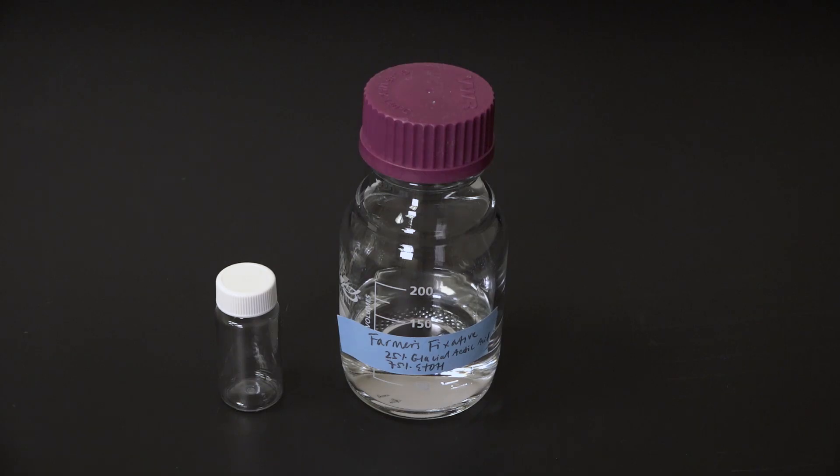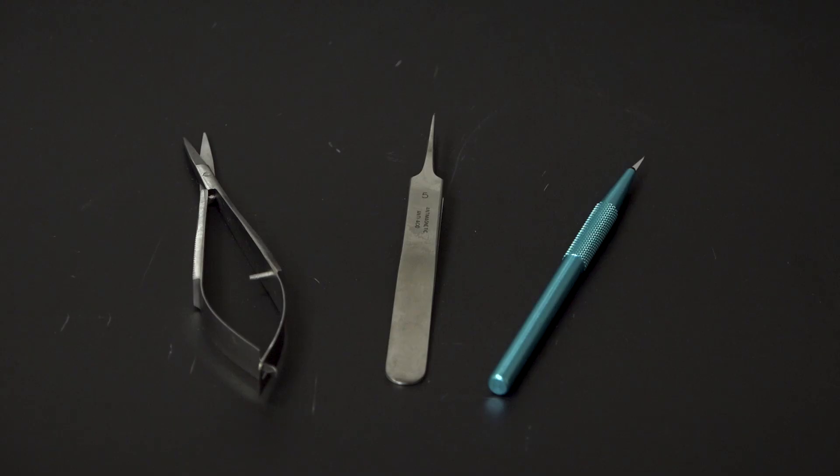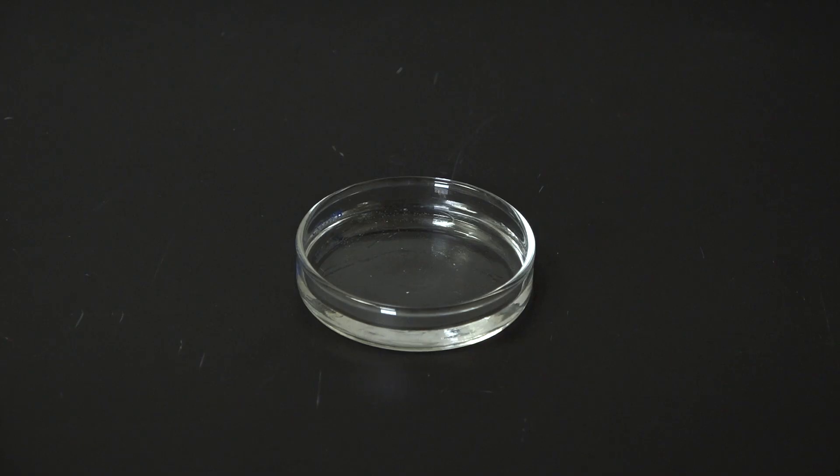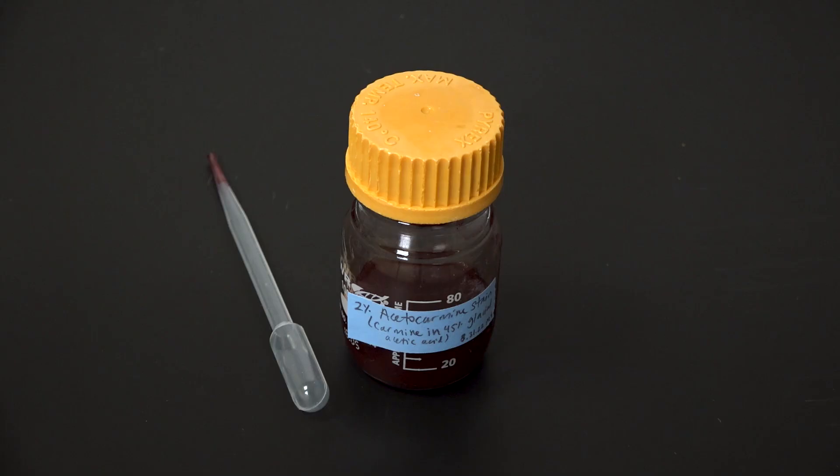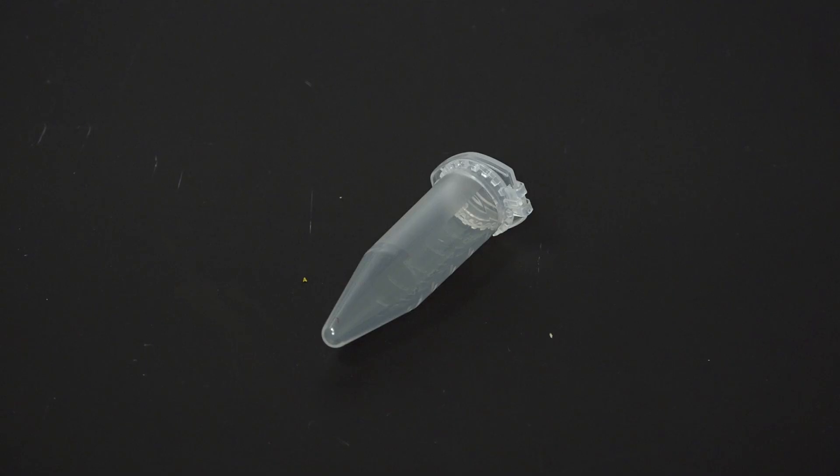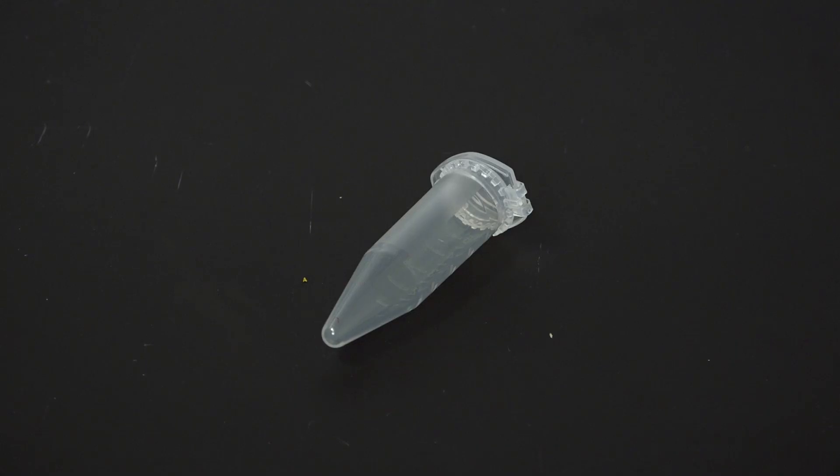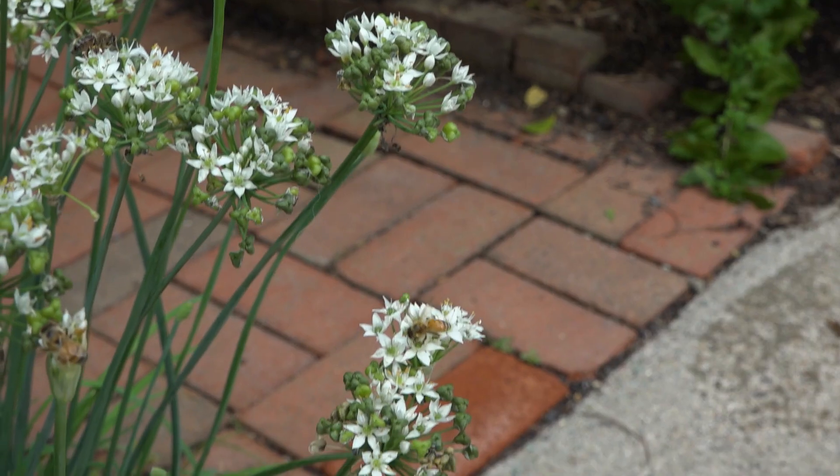You will need a vial of farmer's fixative, also known as one part glacial acetic acid, three parts ethanol, some dissection tools like forceps and scalpels, a dish of tap water, 2% acetocarmine stain and a pipette, microscope slides and cover slips, a blunt object like the bottom of this test tube, a light microscope, and flower buds.